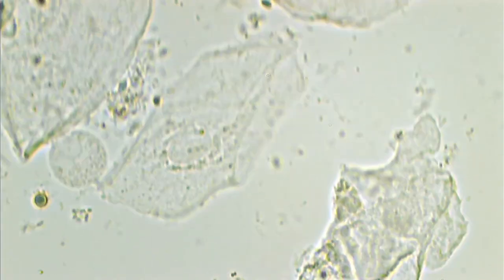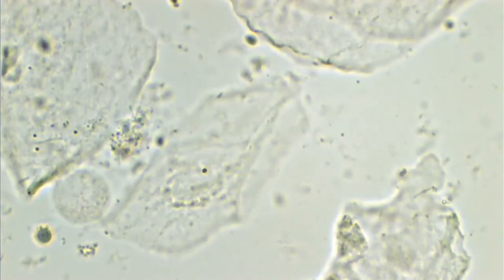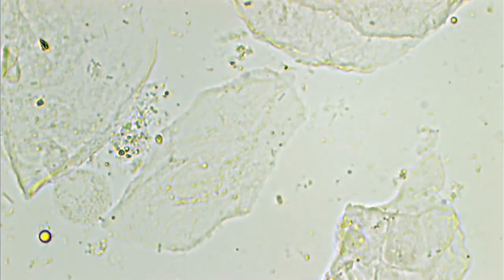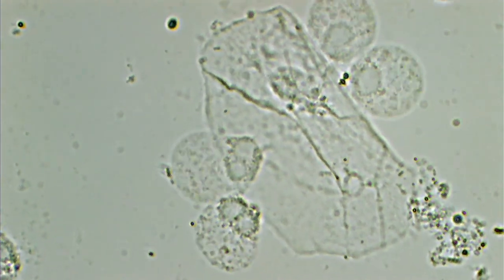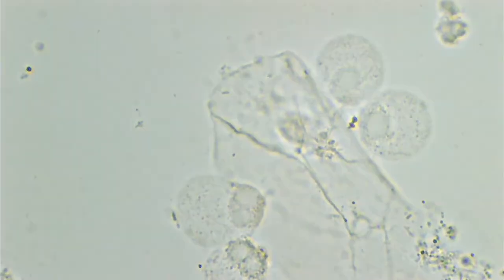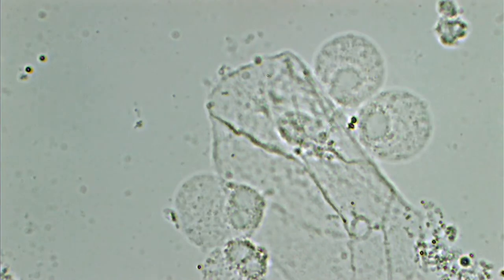Hunting around — what's that? An eosinophil? The textbooks tell you about the granules, little poison pills for invaders and stuff, but I had no idea of the amount of jiggling going on all the time. Here's a party of these things — they're multi-lobed, but don't seem to have three or more, and the granules look evident. So I'm thinking eosinophil rather than neutrophil, but I don't know. Maybe the stats I have in mind are for blood, but this seems out of proportion. Whatever — they're damn cool.